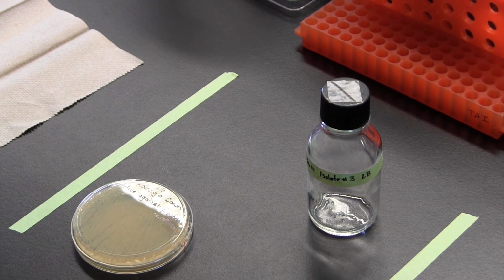So in this demo, we're going to try and walk through the many stages of the chemical extraction, which comes towards the end of the Small World Initiative semester. The chemical extraction procedure, generally speaking, is going to require 4 lab times. So it can take up to 4 weeks if you're meeting once a week, or 2 full weeks if you meet twice a week. But it's something to think about just in terms of spacing out and time management. So we're going to do our best to walk you through the different steps and stages so that you can kind of know what to anticipate with your results.